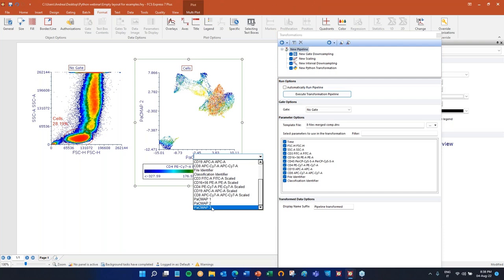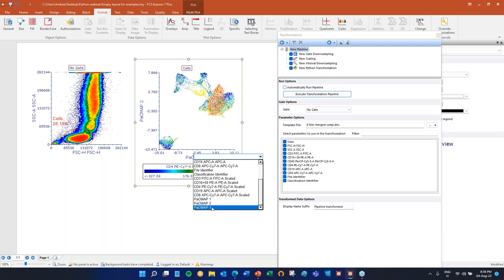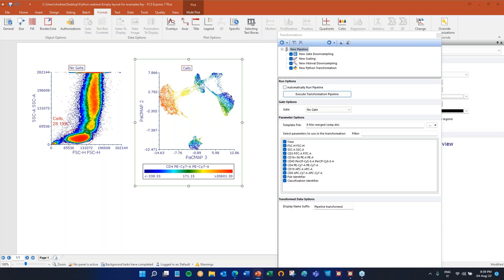Now I can display the legend and see where my CD8 or CD4 populations are. Just to show you, if you change options — say I want to increase the Number of Dimensions of PacMap from two to three — I can change this without touching the code, then click Execute Transformation Pipeline and PacMap 3 will also be generated.